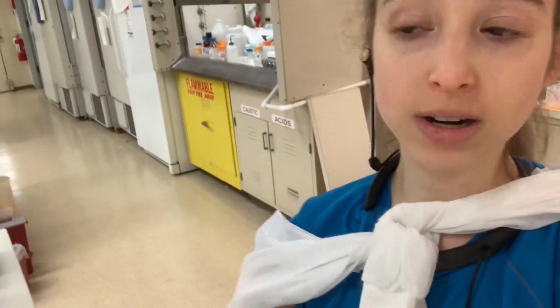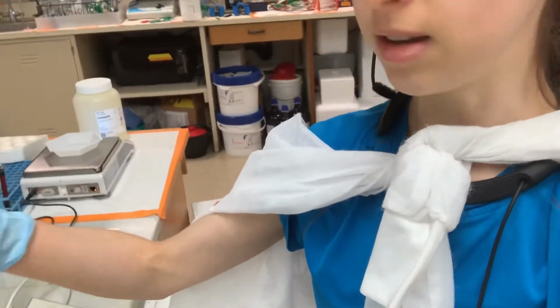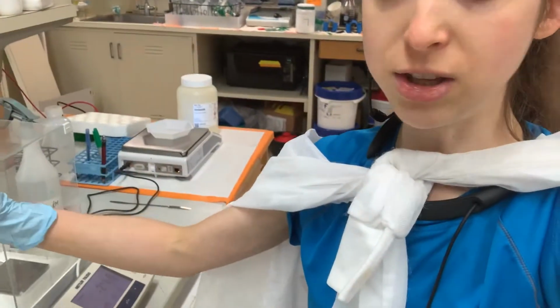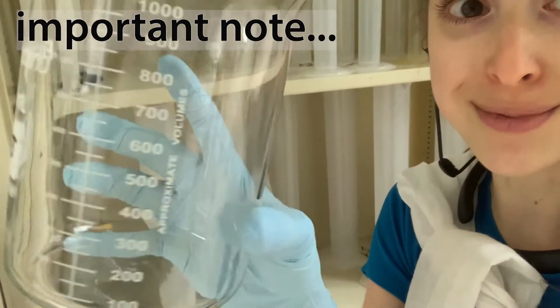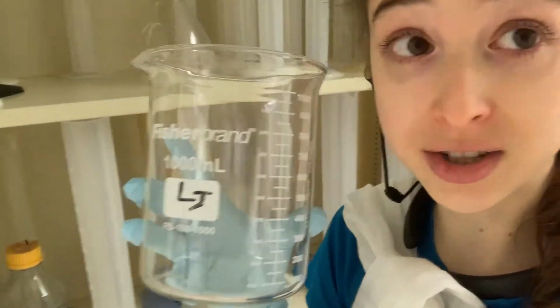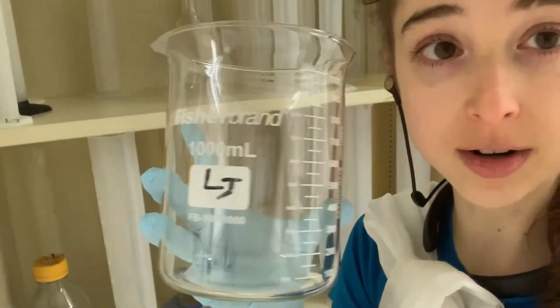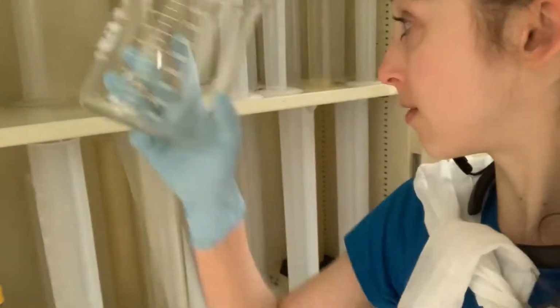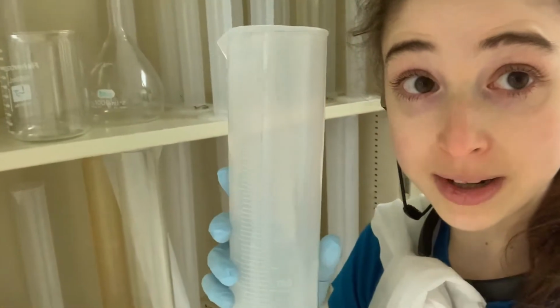So then I would pour it into a graduated cylinder, and fill the cylinder up to the volume that you want. These are not for measuring. These are approximate values. So these are really great if you're wanting to dissolve your liquid. So normally I'll start off mixing in one of these with a stir bar on a plate, but do not trust these volumes. These are approximate volumes. When I actually do the measuring part, I use a graduated cylinder.